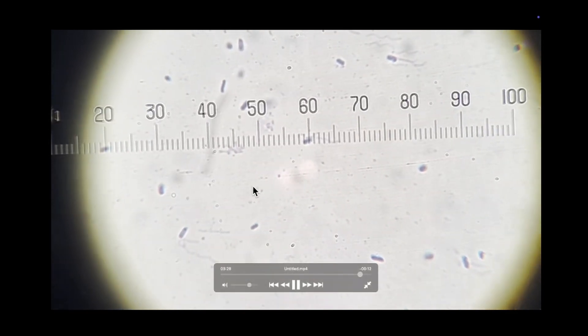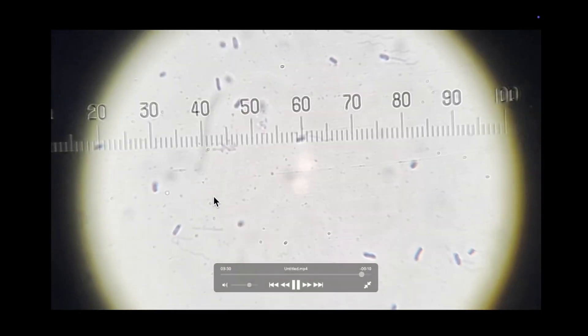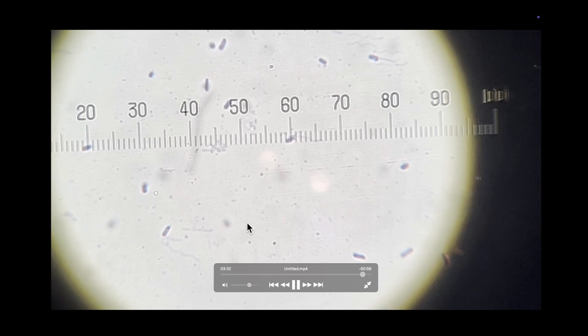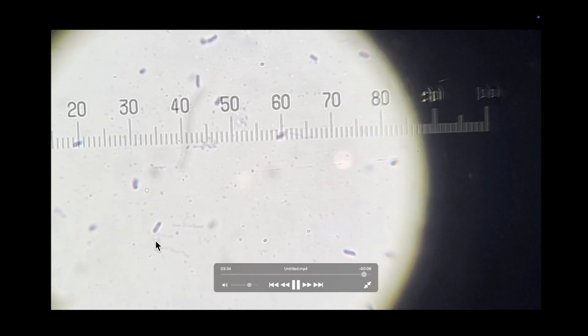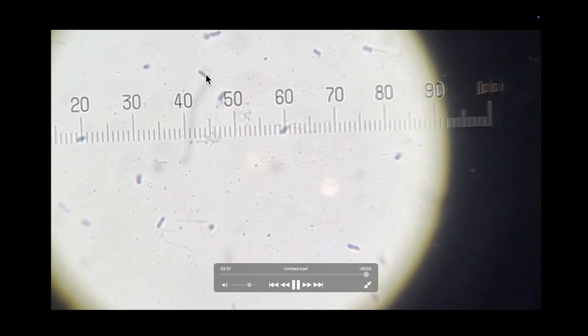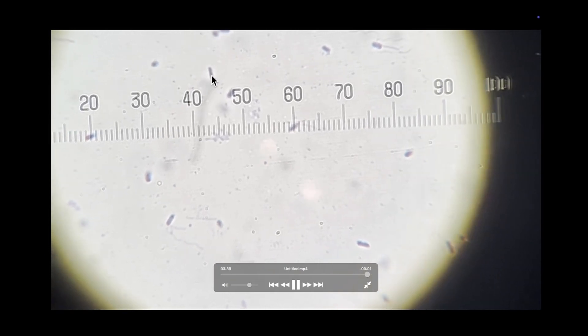This is a video showing what to expect as you view under the microscope. You can see the flagella here and you can even see sometimes cells that are still moving.